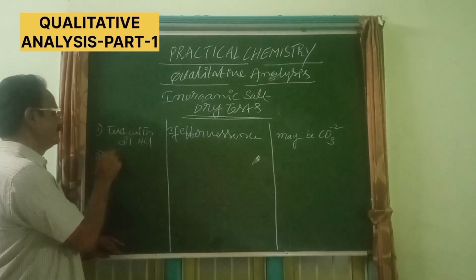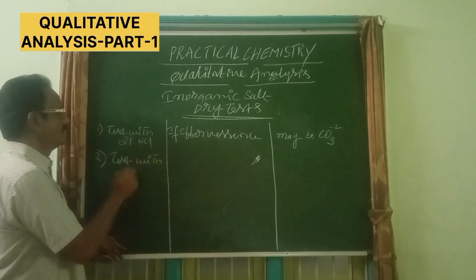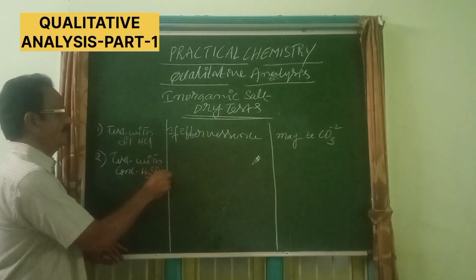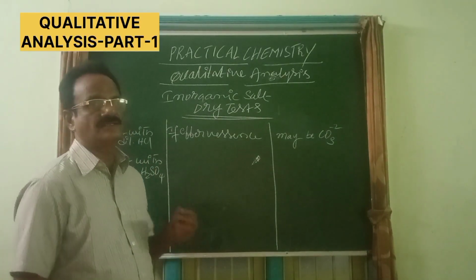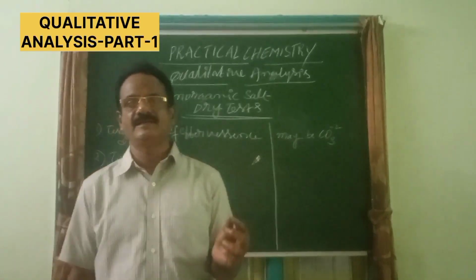The second one, test with concentrated H2SO4. A few drops of concentrated H2SO4 are to be added to the salt taken in a test tube.